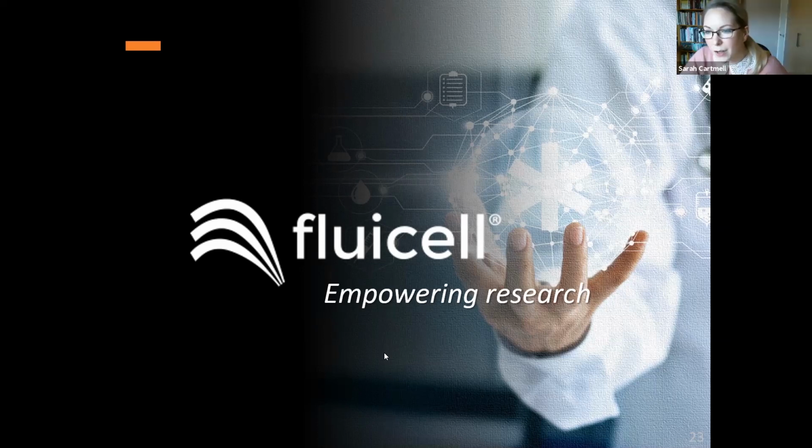You have asked again, are there plans to miniaturize the BioPen to multi-well applications like an MEA platform? I'm not sure what an MEA platform is, but typically the HCF tech that we have, we have 3 different platforms that we currently have: the BioPen, the BioZone, which is going to be released soon, and the Biopixlar.